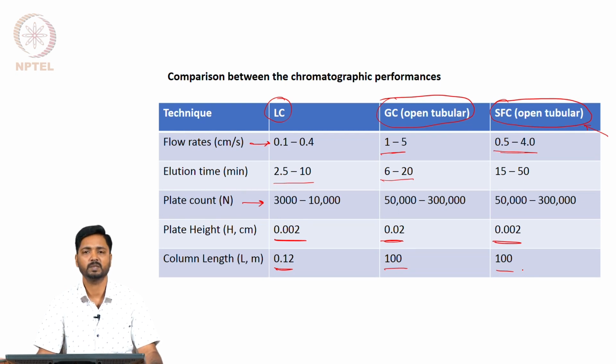Now, it is important also to make note that properties of supercritical fluids are very intimately dependent upon the pressures and the temperatures that are operating.